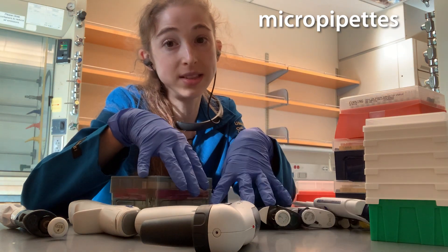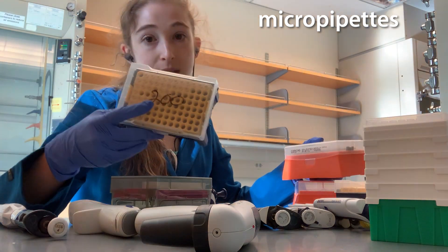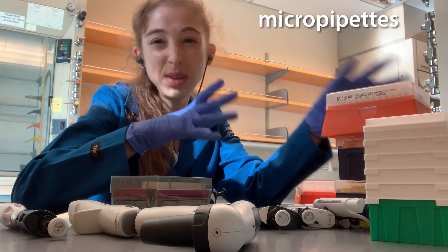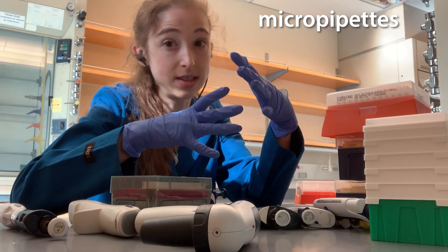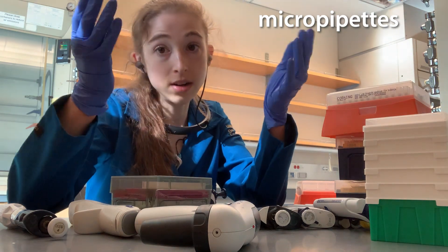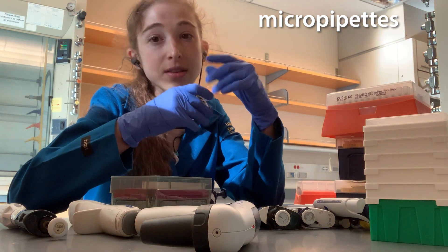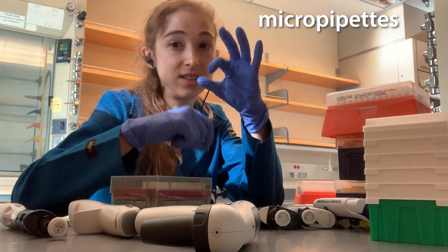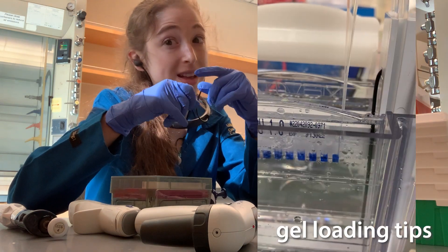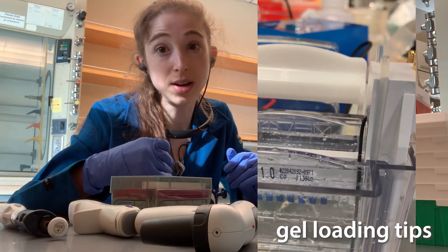Each of these pipettes is going to have its own distinct tip size. So like a P200 and a P100 box — a P10 and a P2 typically use the same size tips though. Sometimes you'll see 'XL' on a tip box — that just refers to extra long. Extra long tips are great when you're trying to get to the bottom of tubes. They're not quite as long as gel loading tips, which are really long and skinny so you can get into the bottom of a gel well.